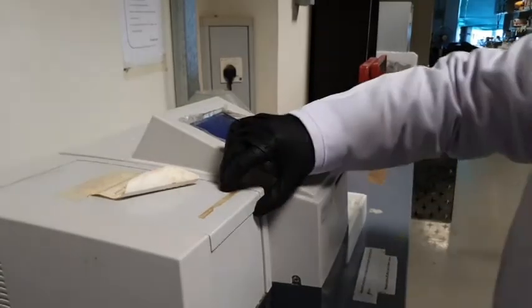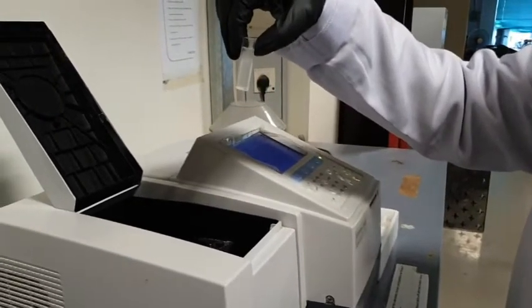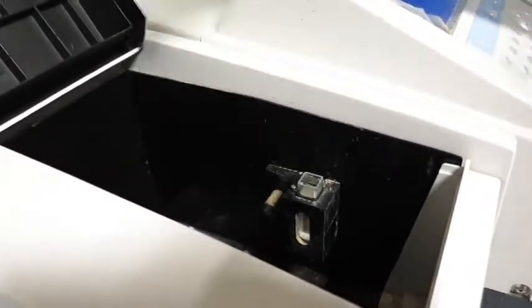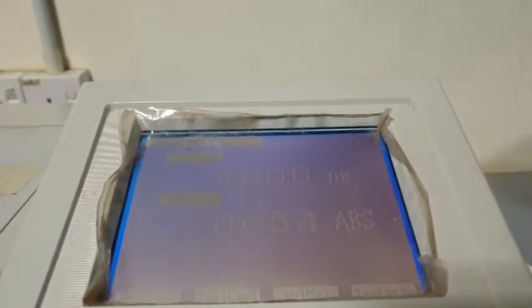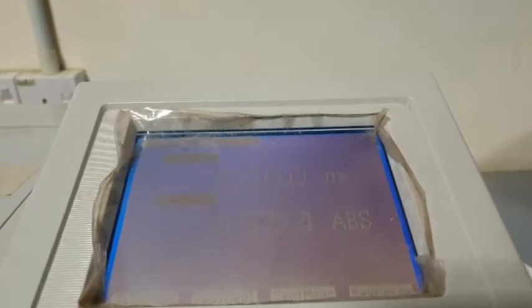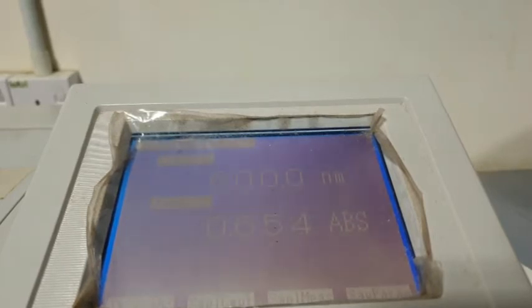Take out the blank and place the cuvette containing your sample. If your culture has sufficiently grown, the absorbance value will be around 0.5 to 0.8. If the value is lower, you need to incubate the yeast longer. And if the value exceeds the range, you need to dilute the yeast.